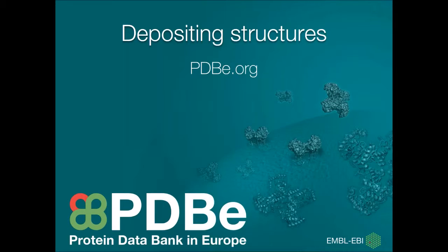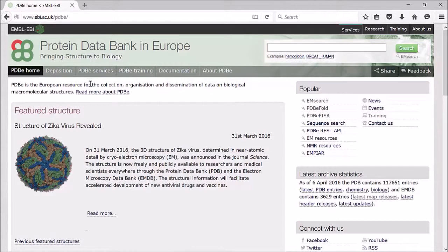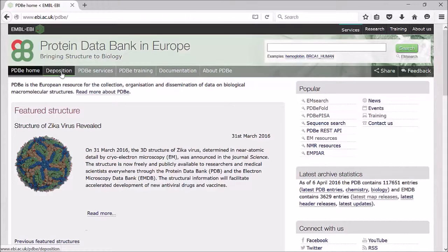If you are looking to deposit a macromolecular structure, this can be easily found on our website. Go to pdbe.org and click on the deposition tab at the top of the page.